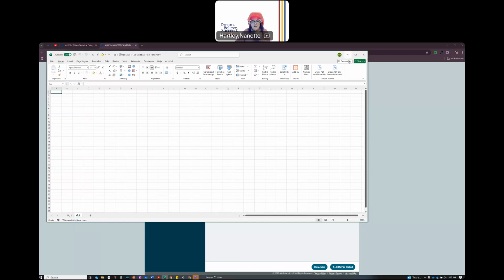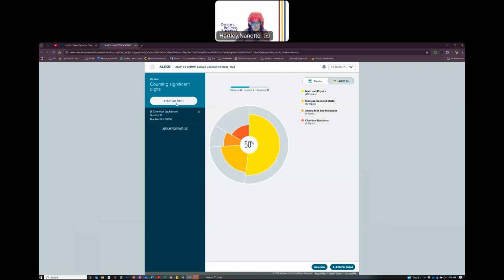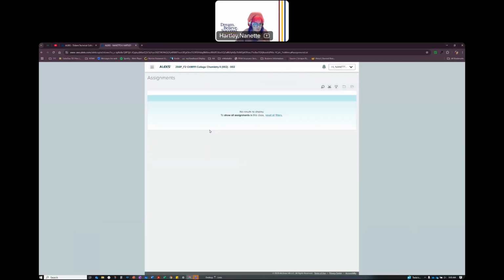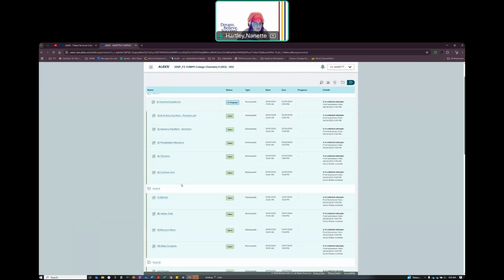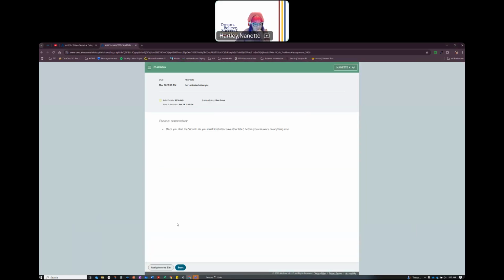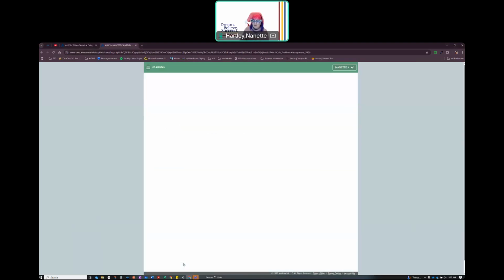So I'll minimize that. And what I'm going to do is go into the second virtual lab here, which is the buffers. And I'm going to open this, and I'm going to go ahead and start. Now, this is about buffers. We've only recently started talking about the buffers.